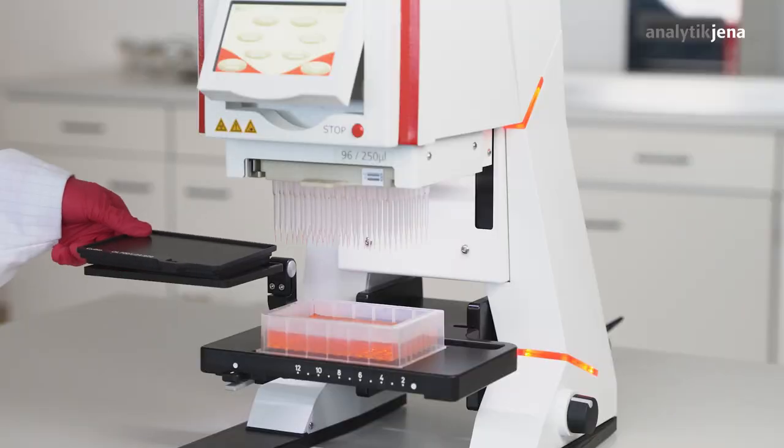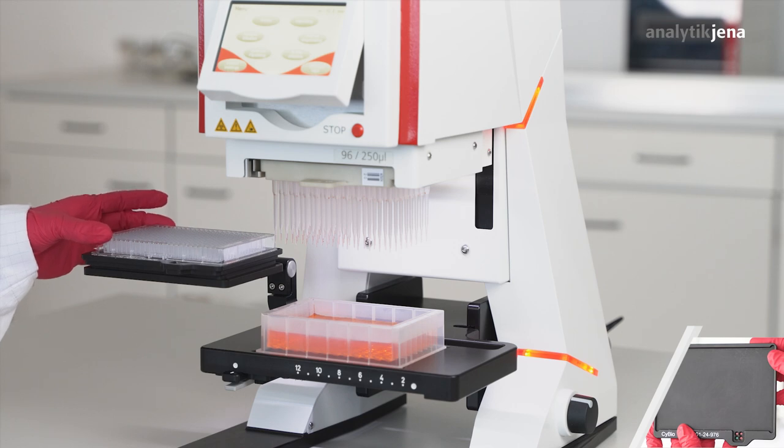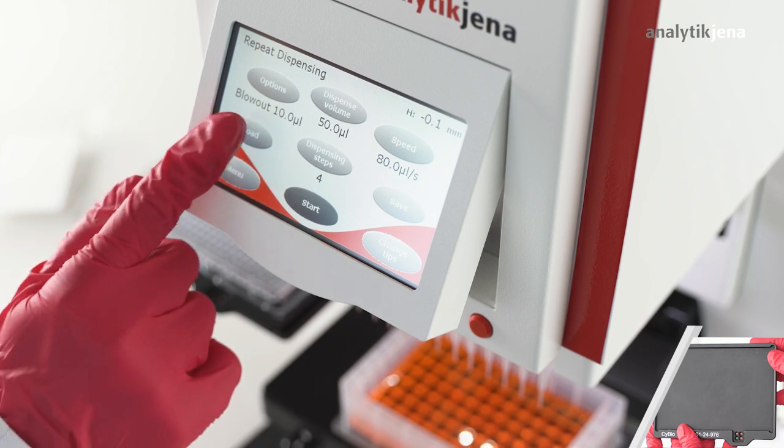The microplate adapter 384 is placed to the upper position with the target plate. The reservoir with the liquid is placed to the lower position. For reformatting, the pipetting mode repeat dispensing is used.